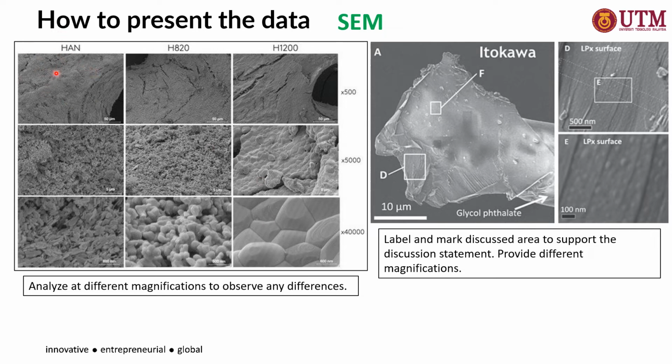For example, here you have three different samples, and you analyze them at different magnifications, and then you just arrange the result data.